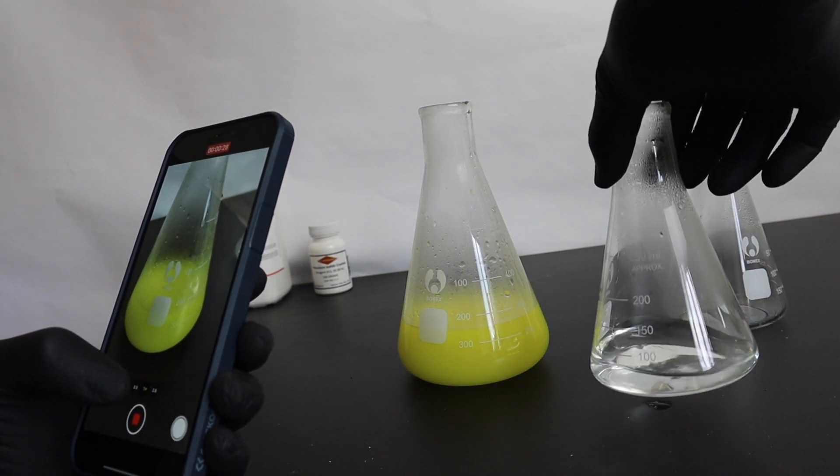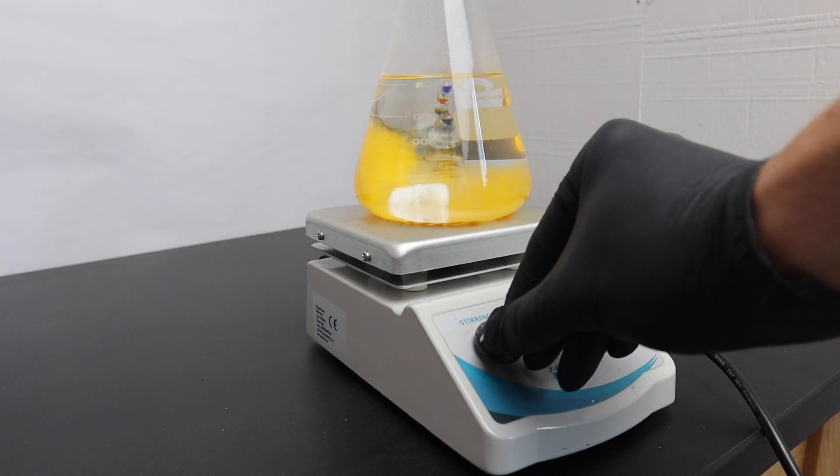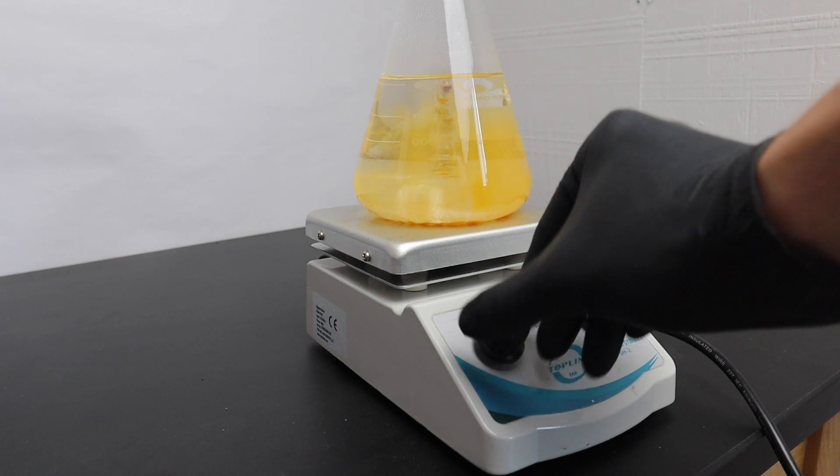I did not heat up the water enough on my first attempt and the lead iodide precipitated too quickly. I made an attempt to save it but quickly decided to just try again.